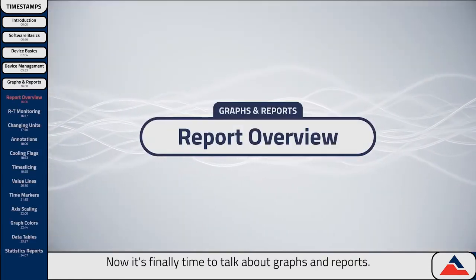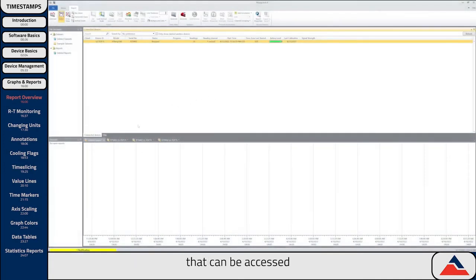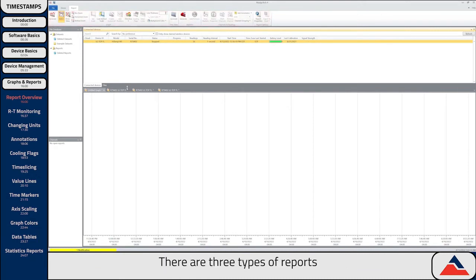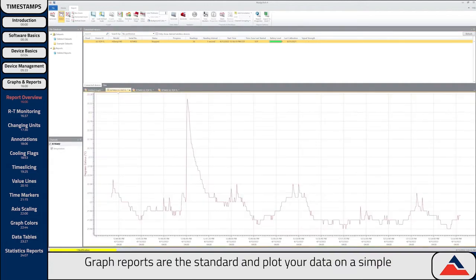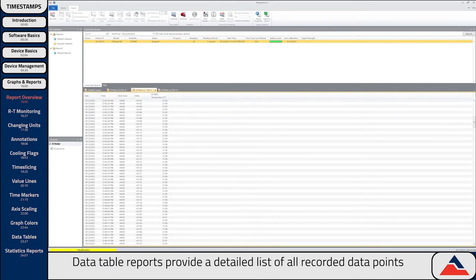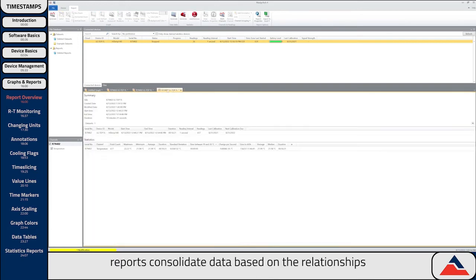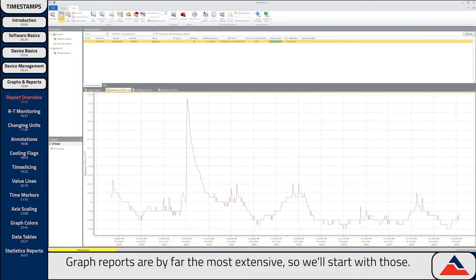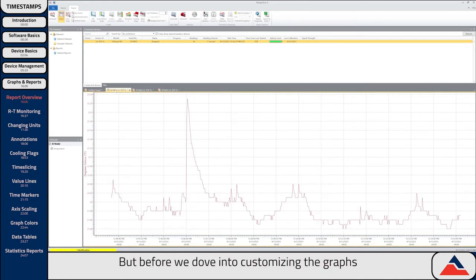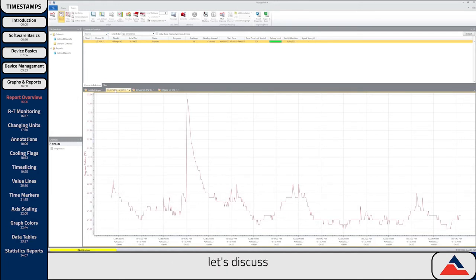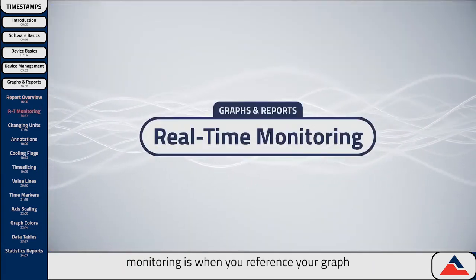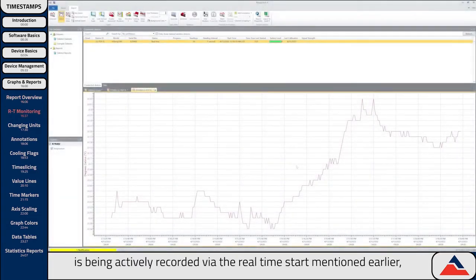Now it's finally time to talk about graphs and reports. Reports have their own full set of features that can be accessed by selecting the Reports tab at the top, opening up the Reports menu bar. There are three types of reports that can be generated by the Magitek 4 software: graph reports, data table reports, and statistics reports. Graph reports are the standard and plot your data on a simple X-Y graph. Data table reports provide a detailed list of all recorded data points, and statistics reports consolidate data based on the relationships between the readings. Before we dive into customizing graphs, let's discuss a couple features associated with real-time monitoring.